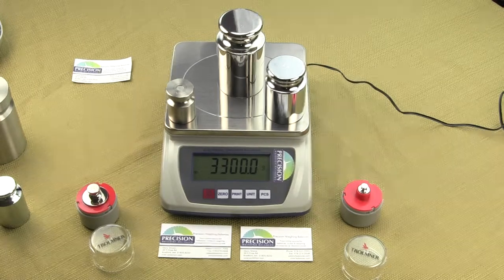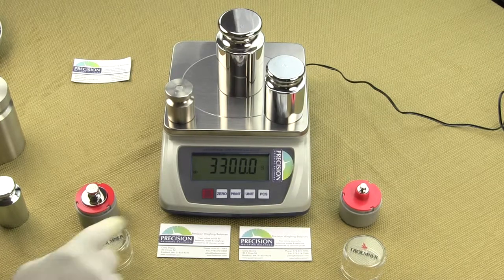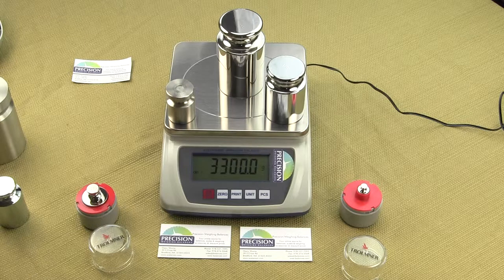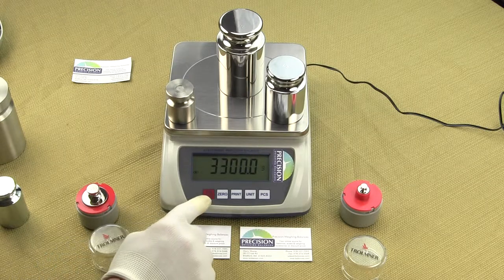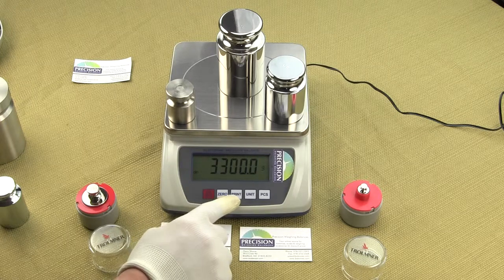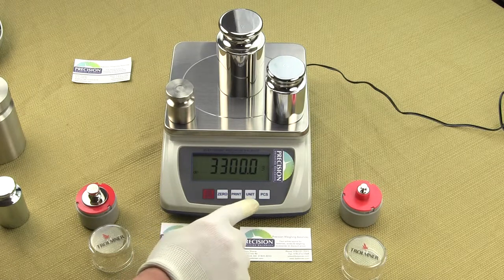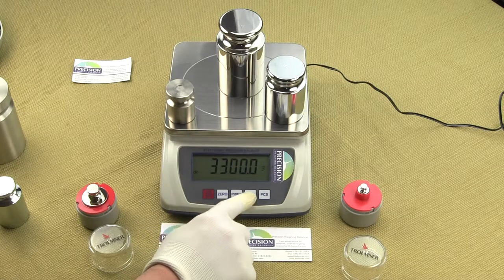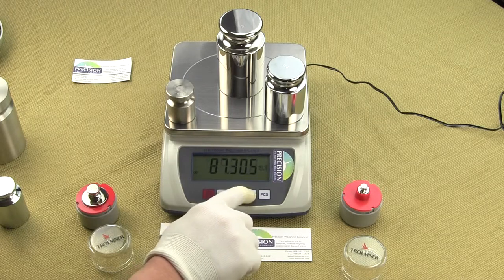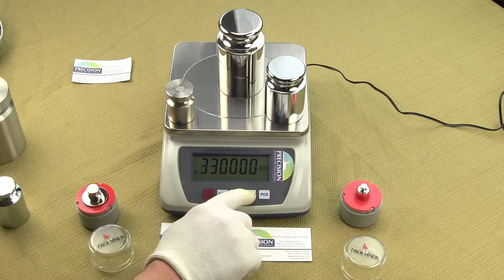This compact digital scale is very simple to operate and features five tactile keypads to complete any operation. We have an on/off button, a zero button for taring a container, a print button for sending data via the RS-232, a units key for changing the weight mode, and finally a parts counting button if you want to do piece count.